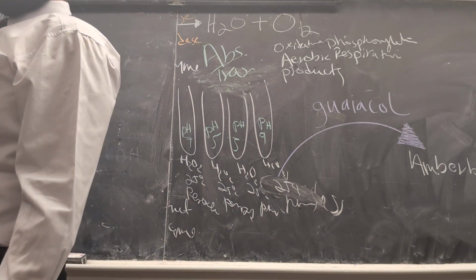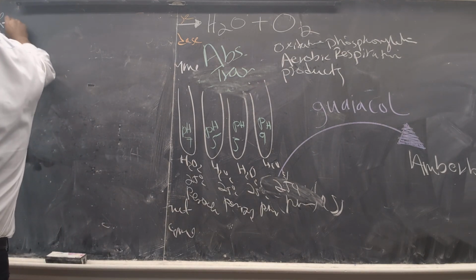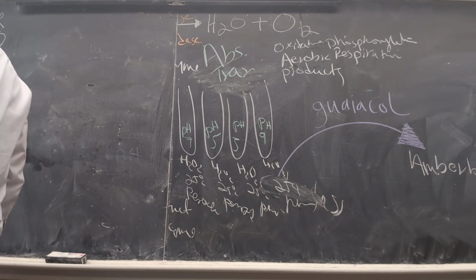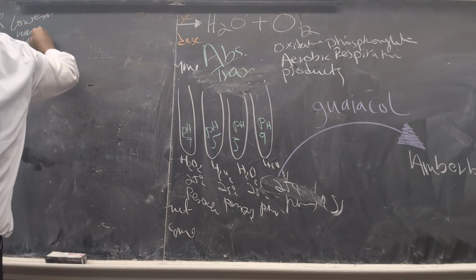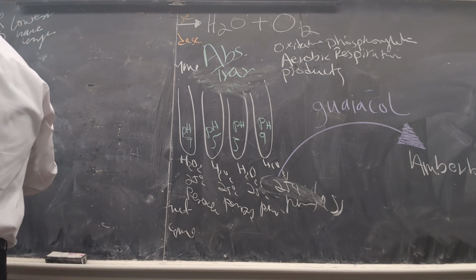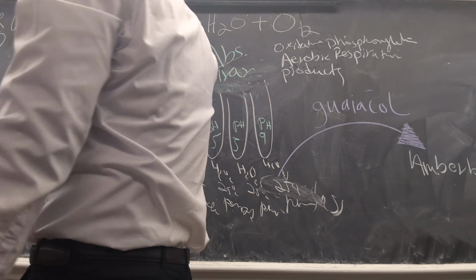Now this order. Why is red at the top? Why is it ordered like that? Why in the rainbow is red at the top, and not in the middle? That's the highest wavelength. Excellent. That's the lowest wavelength. So that's the lowest wavelength, and that is the highest wavelength. Then we're going to put all of these test tubes with their content.